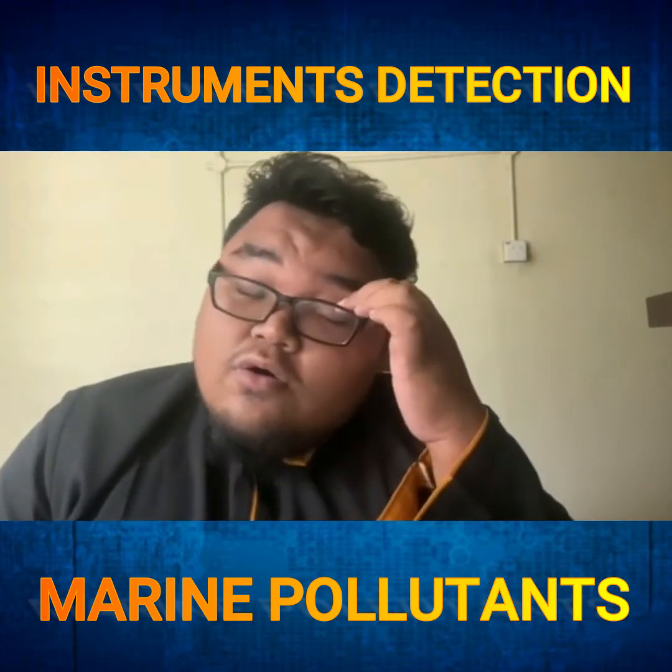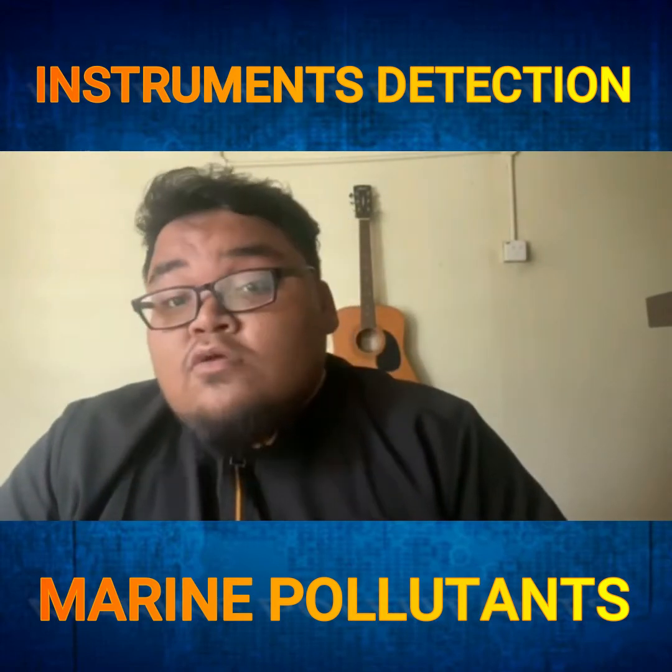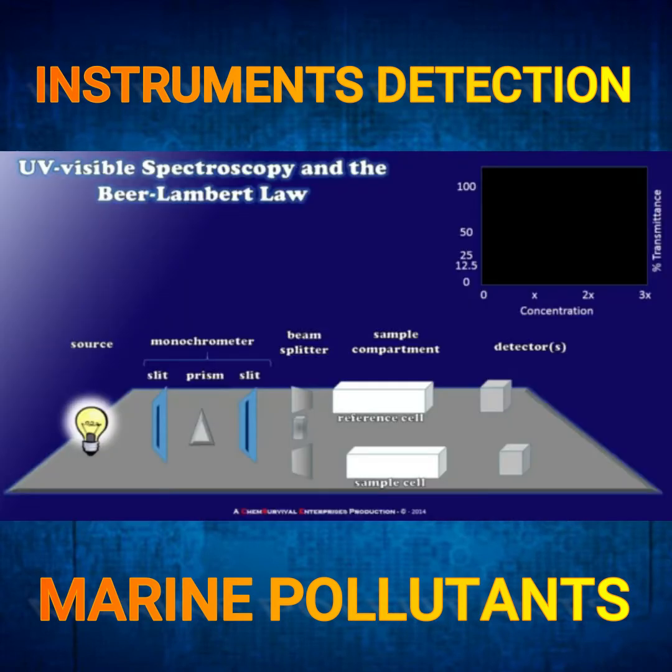So we will go on how the UV-VIS spectrometer works. First of all, we have the source of the light. In this case, we use a lamp. We have the presence of the light, then it passes through the monochromator.